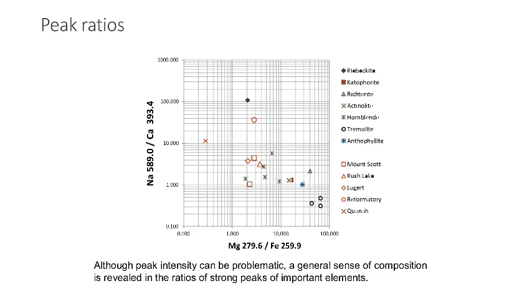These are seen here. The individual granites from which the amphiboles came are shown in the red figures across the diagram. For comparison, I've also plotted the peak intensities for some known and well-characterized amphiboles in the various colors on the legend at top. What we can see here is there are specific ranges in which the populations fall, and that might be useful for telling us the differences between these amphiboles.